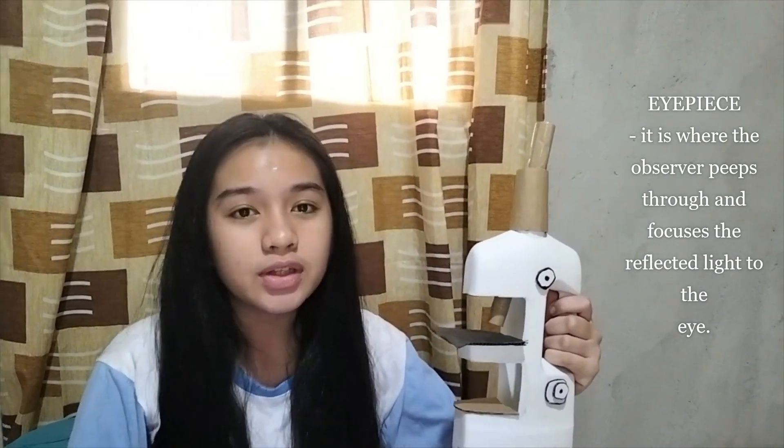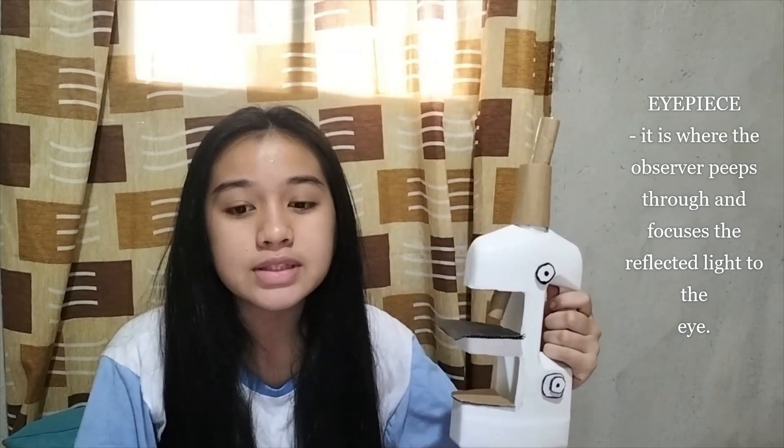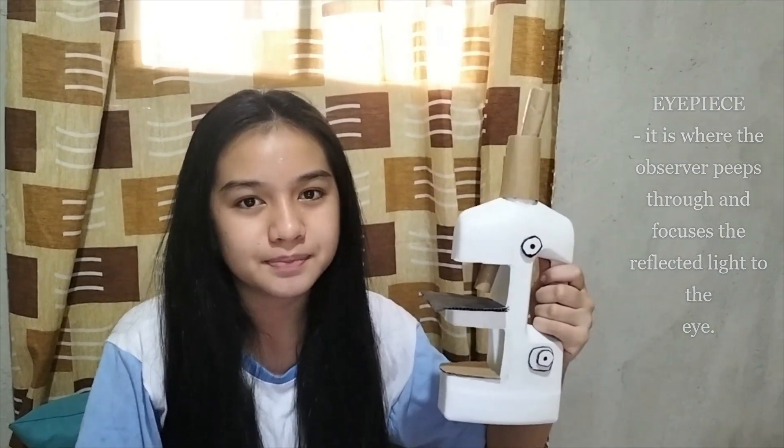This is the eyepiece. It is where the observer peeps through and focuses the reflected light to the eye. This is the body tube — a cylinder attached to the draw tube where light passes from the object to the ocular or eyepiece.